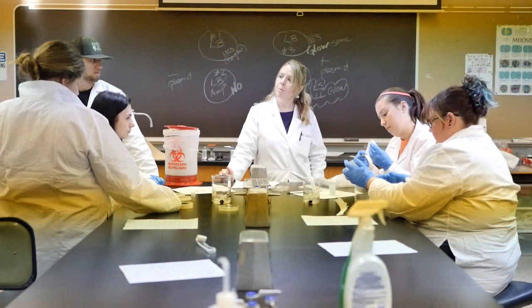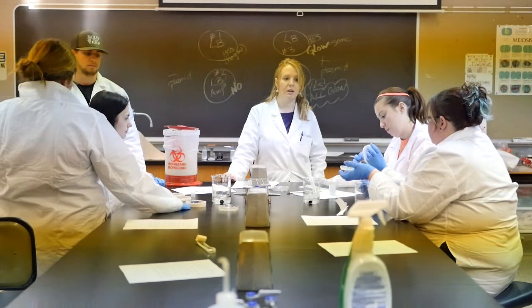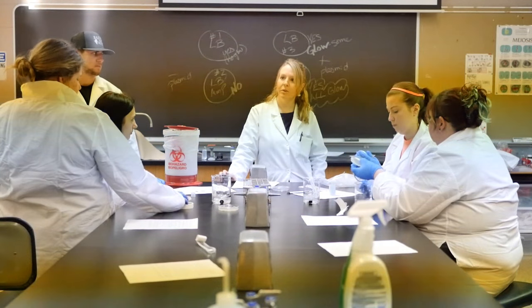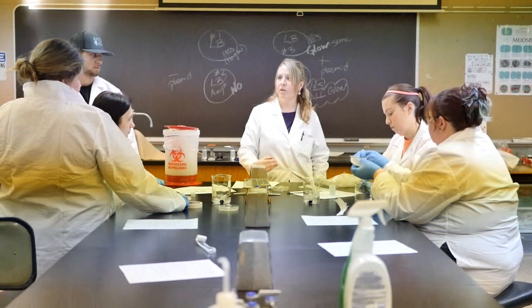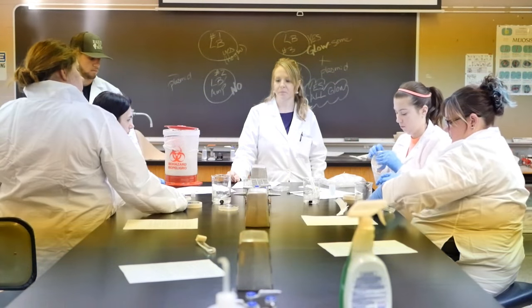If you happen to be around tomorrow, come find me, come look in here. We'll see if there's any glowing. Otherwise, Friday should be the best viewing. If you come up here and look at it on Friday, make sure that the room is completely dark. Go hide in the darkest corner. The darker the room, the brighter they will appear, the more easily they will be seen.